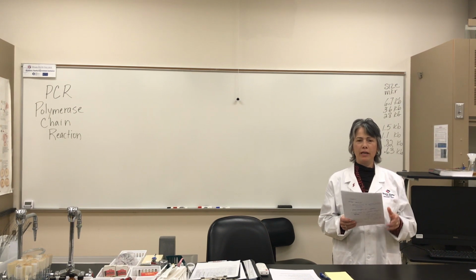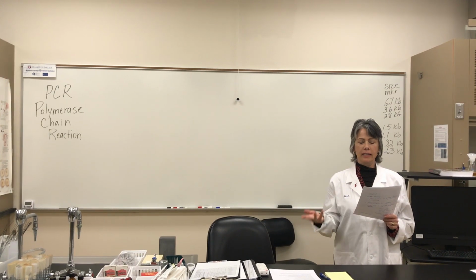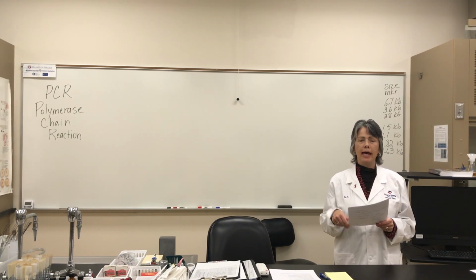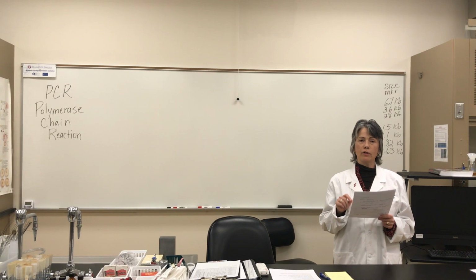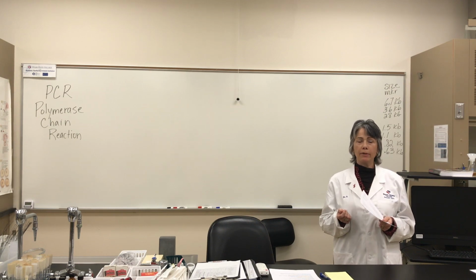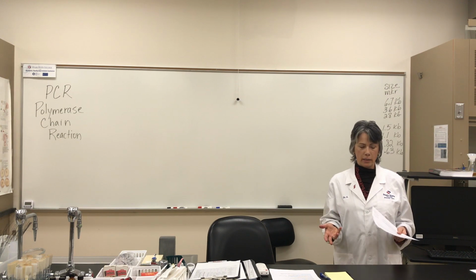Today we're going to do the pre-lab for PCR and then the experiment, but this segment is the pre-lab. So hopefully you read your student protocol for the pre-lab and you read the recommended pages in the online manual for PCR. Don't forget you also have PCR in your textbook, and I would highly recommend you reread that. PCR is a pretty complicated experiment, and I really want you guys to understand it.